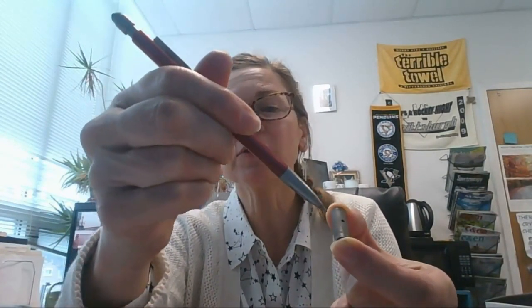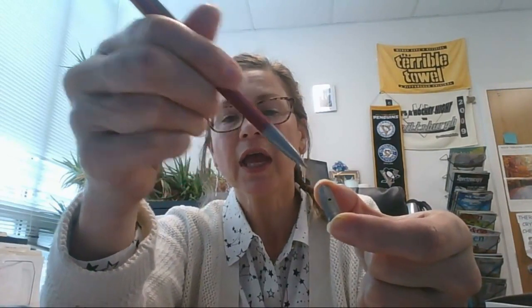This is the furnace atomizer. And maybe you'll have to take my word for it. But at the very top, there is a small hole. And I'm just going to use a pencil to maybe point that out to you. There's a small hole here. And that's where you would introduce the sample, either using an auto sampler or with a micropipet. And this furnace is made of graphite. So, in a furnace AA, a current is applied across this graphite tube. And since graphite is not a good conductor of electricity, it gets hot. And that little drop of sample that you've added gets atomized. When that happens, again, radiation from the hollow cathode lamp shines through. And your gaseous atoms absorb that radiation. So, this is the furnace.